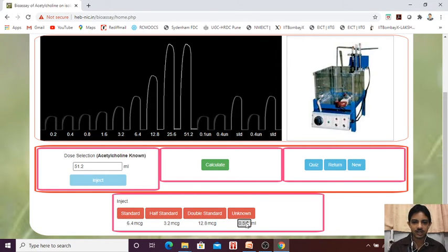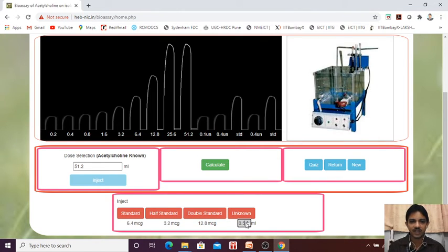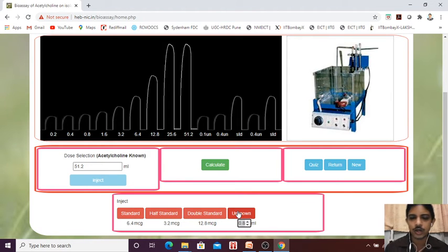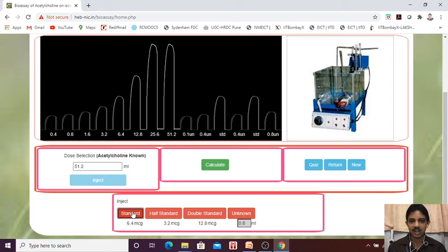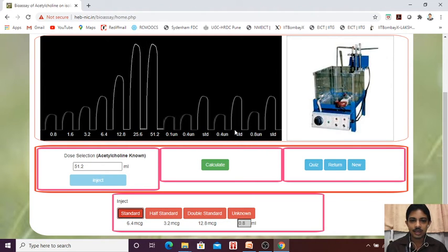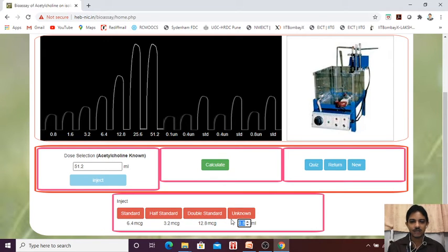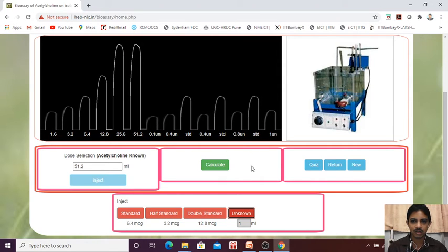You just increase the dose. Here it is not like that you have to double the dose, but of course here you can find that response is small, that's why I am doubling. But it is not required that you have to double the dose unknown. So it is again standard. Unknown will be in between the standard dose. So we will give that 1 ml. Is it fine? Just check it. No, still.